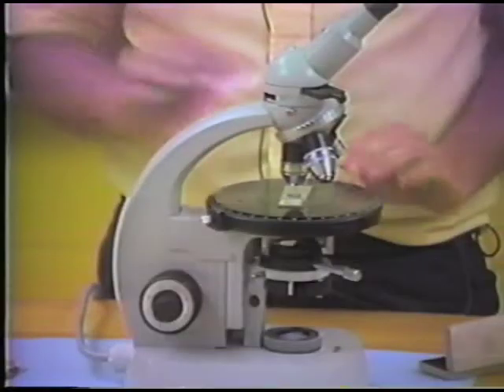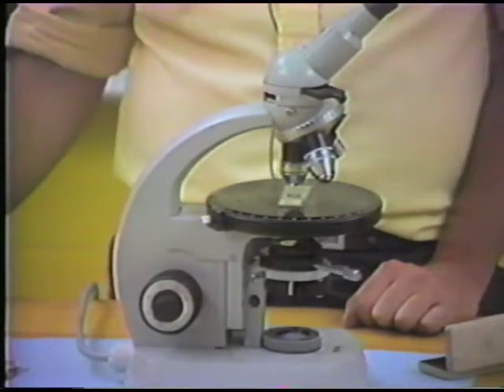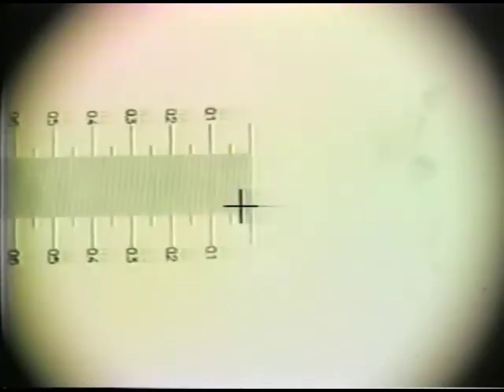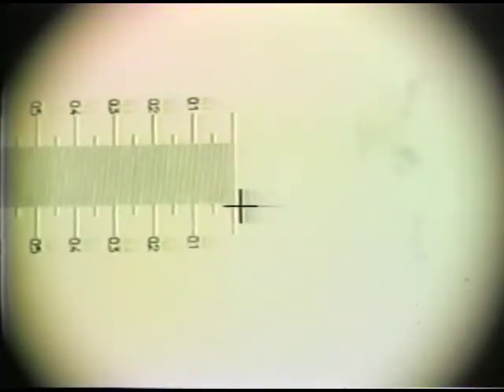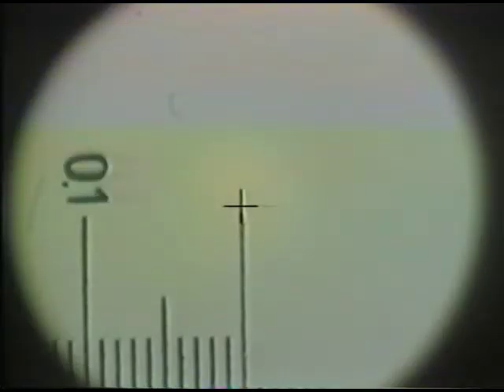Now I'll move to the medium power objective and make the same kind of measurement. In this particular case, I can see, measuring from the center of the field of view to the edge, a distance of 0.55 millimeters represents the scale of my medium power objective. Now I'll go to the high power and again make the same measurement.